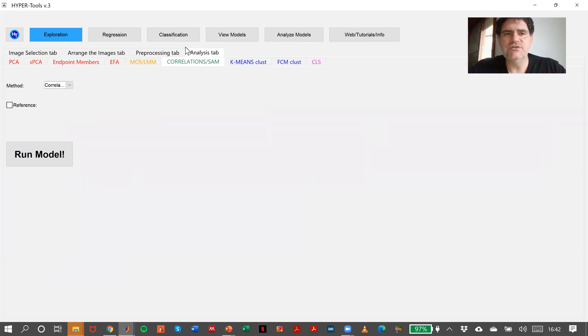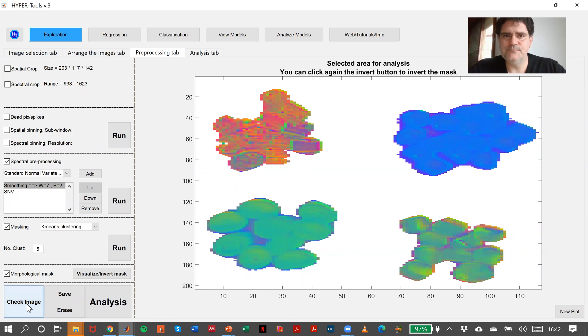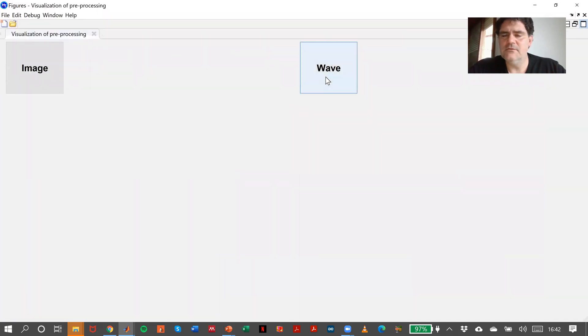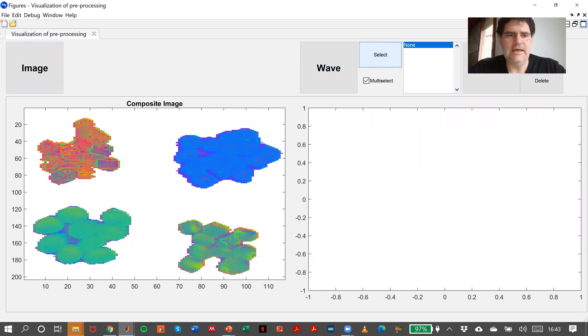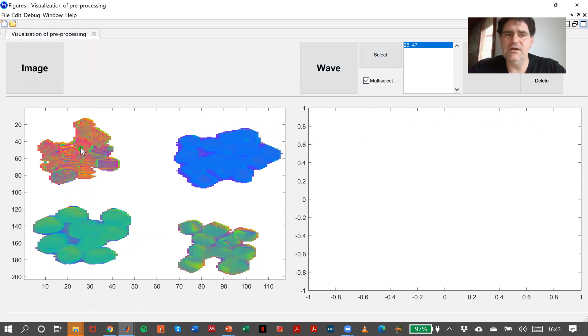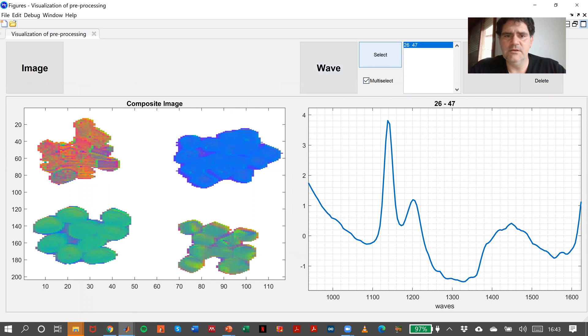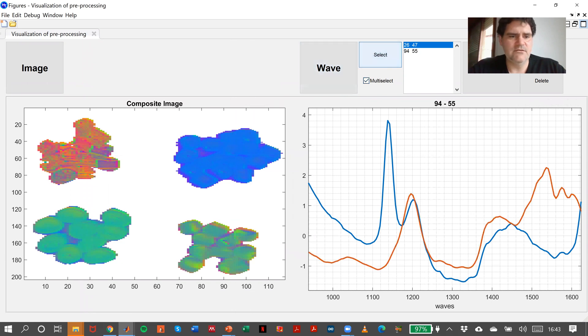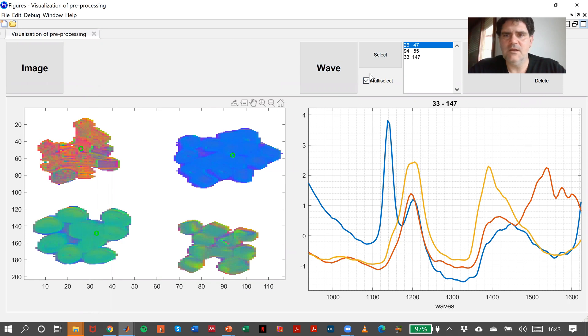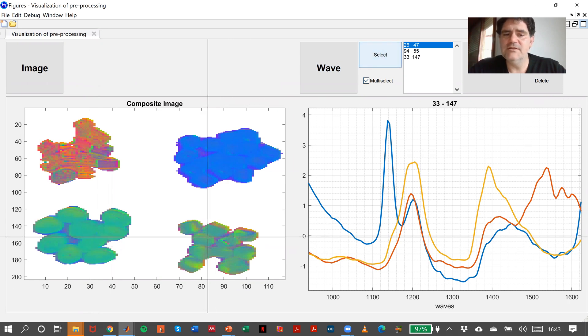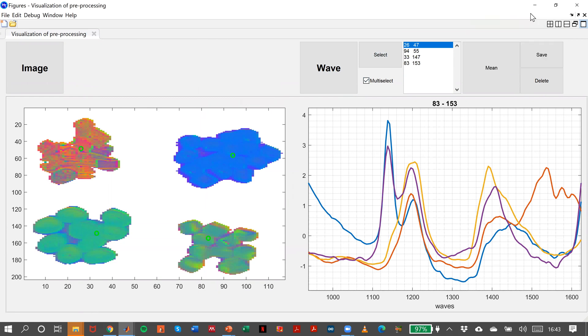One of the things we could do is to come back to the preprocessing tab, go to check image, and here we can create our database. Like this will be the first one, this will be the second one, this will be the third one, and this will be the fourth one. If you need the averages, you can do it in here, in this bottom here.